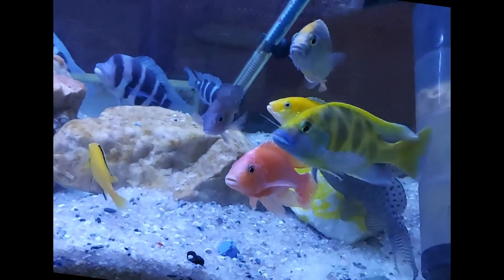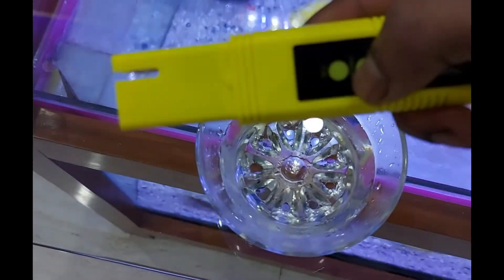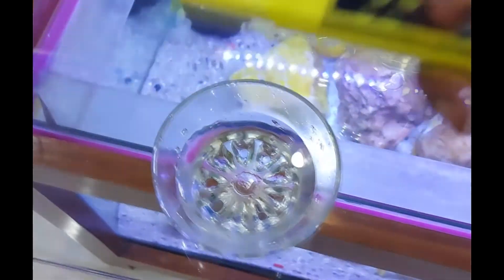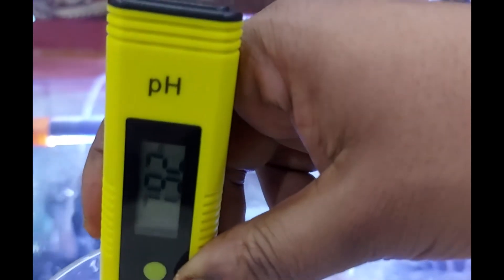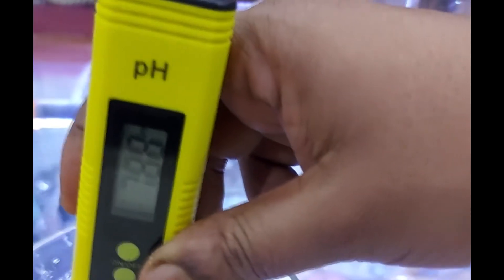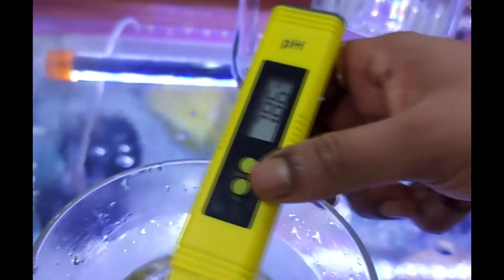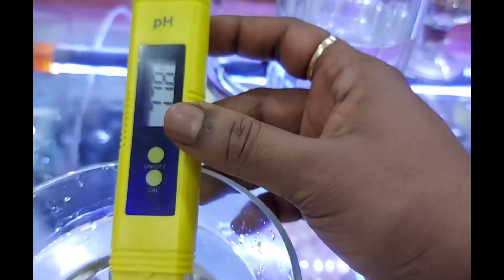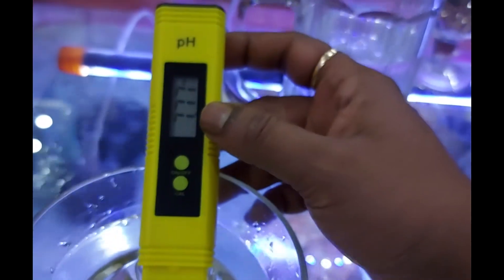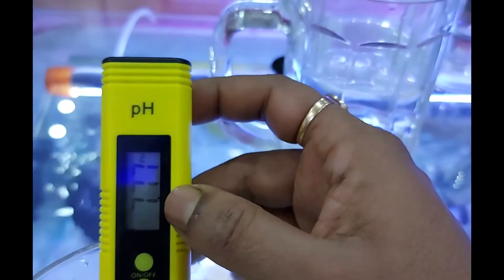Now it's time to test my aquarium water pH. I have taken out a bit of aquarium water in a small bowl. Let us turn the pH meter on and dip it inside the water. Wait for the reading to stabilize — it will take 20 to 30 seconds. The reading is going down; hold it there for 20 seconds. Now it's stable at 7.77, so 7.77 is my aquarium water pH.